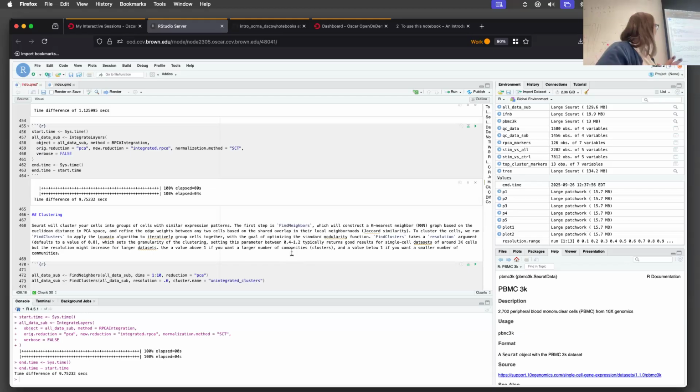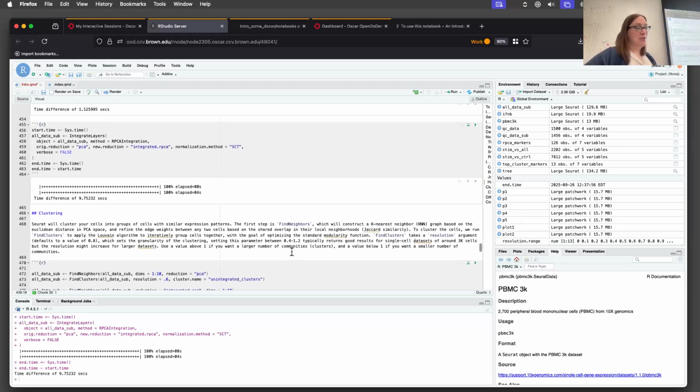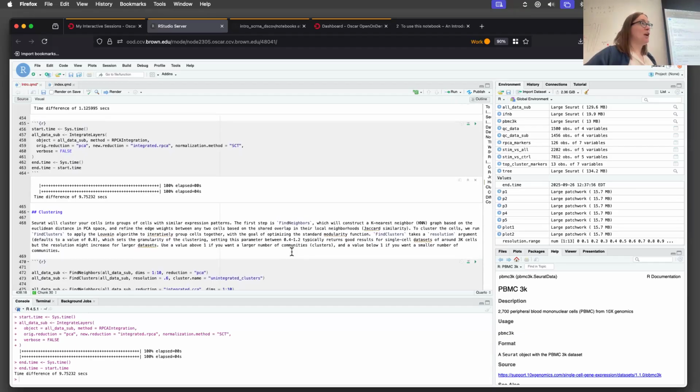I try all these different methods. I do a lot of visualization and exploratory data analysis, and try to pick the one that seems the most consistent with the expectations of the people who know about the system. In this data set, for example, where I had the cell sorted in the pooled data, when I brought back the CCA integration to Lalit, he said this looks totally wrong.